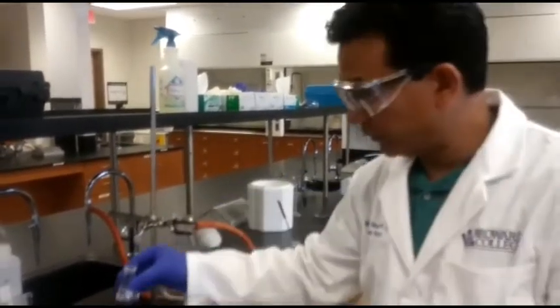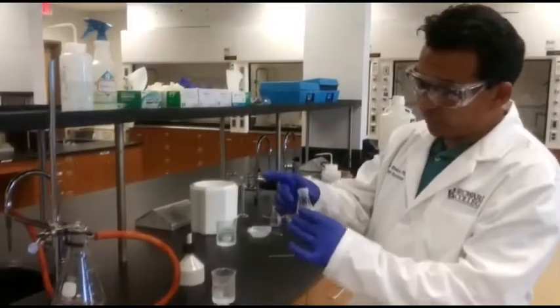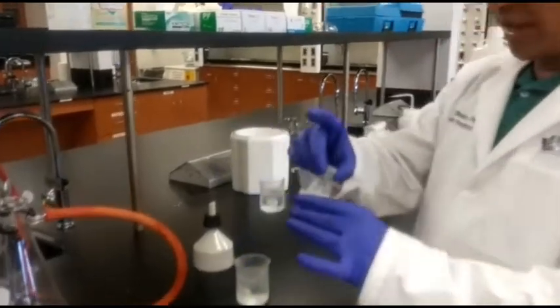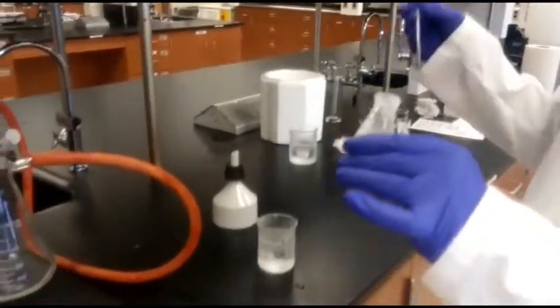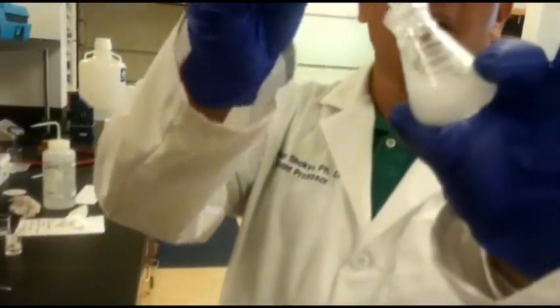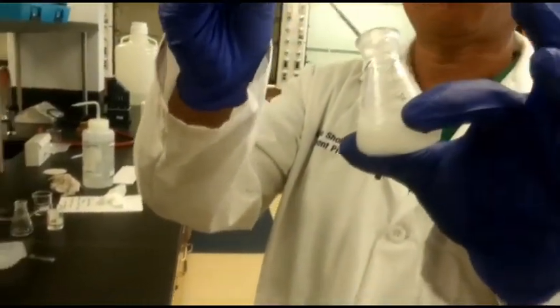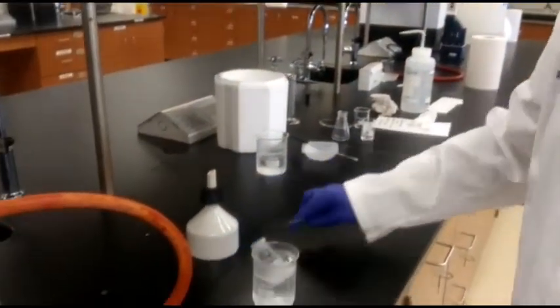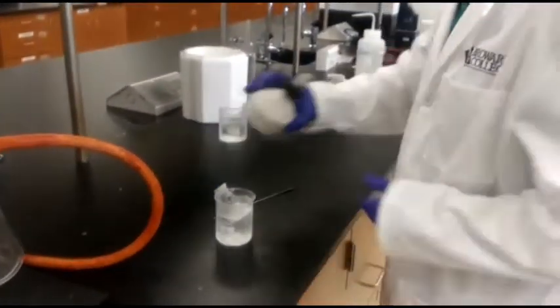Let it sit here. Okay, recrystallization process: we have cooled our solution in the ice bath, and we have got a good amount of the recrystallized acetylsalicylic acid. You can see that. Now we can separate this by doing the vacuum filtration again, as we did previously. So let us set up the vacuum filtration.